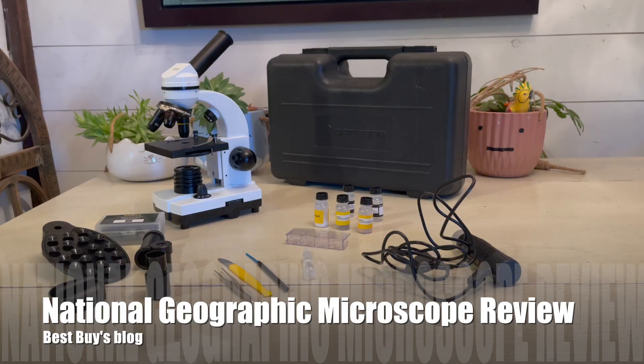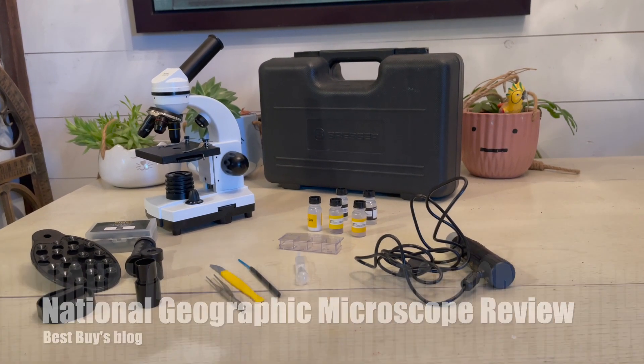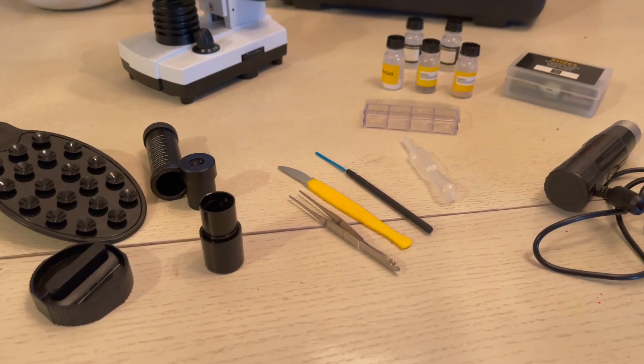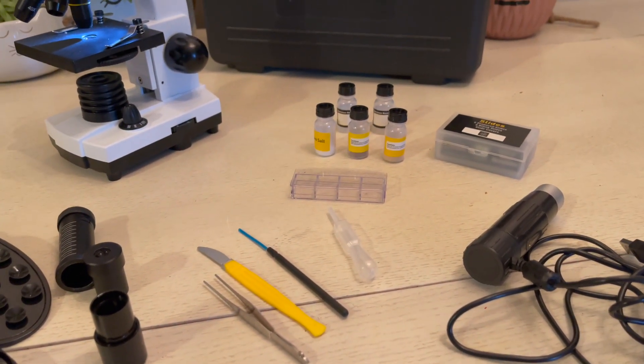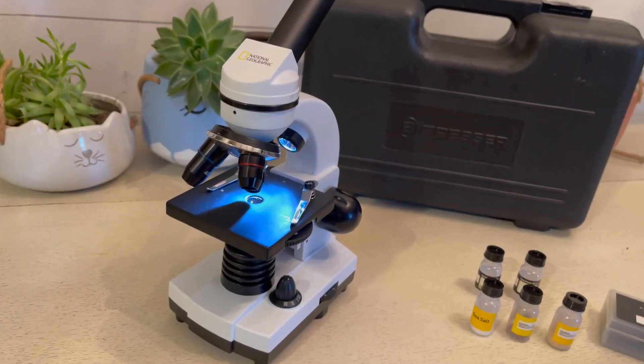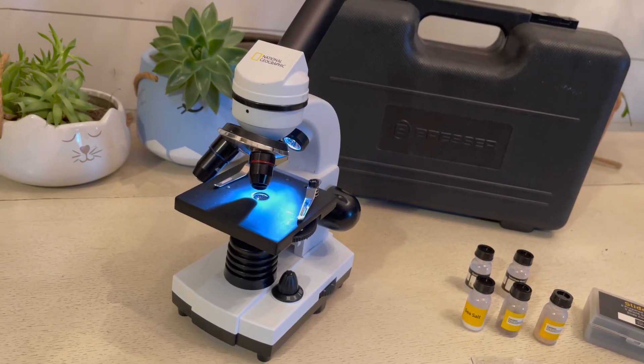Hey, it's Shelley from Best Buy's blog. This week I've been taking a look at the National Geographic microscope. It comes in a kit with everything that you see here and it is a 40 times to 1600 times magnification microscope.